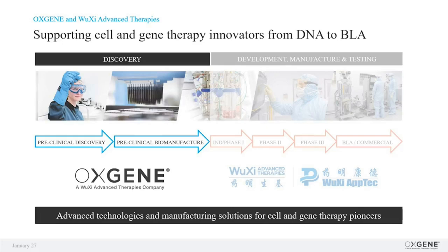In the first part of my talk, I will tell you about our adeno-associated virus and lentivirus production plasmids, and in the second part, I will tell you about the high-quality plasmid manufacturing platform at WuXi ATU.